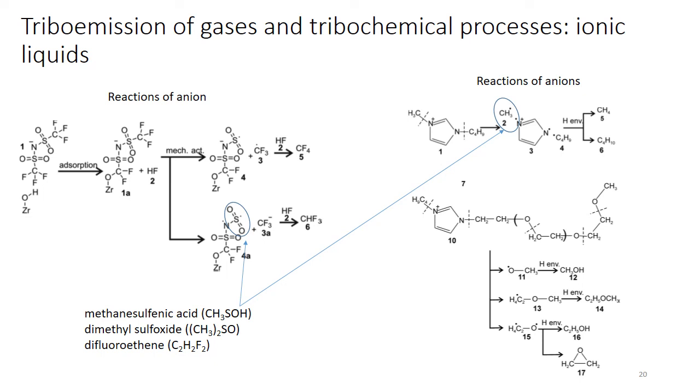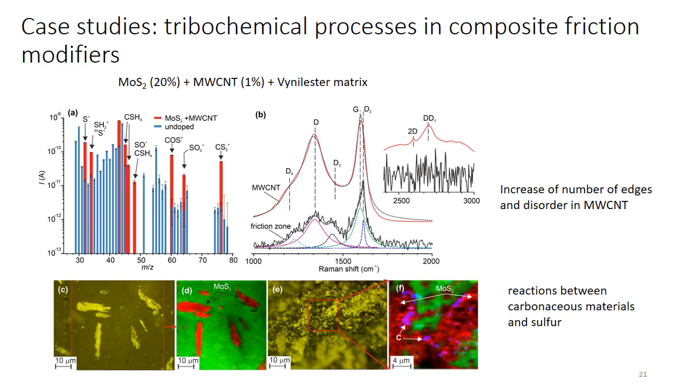So we found in the mass spectrum some components in the range of 50 to 60 which cannot be attributed to any other compound of the ionic liquid, but can point at the formation of compounds which are products of the reactions of the decomposition products of anionic and cationic groups.